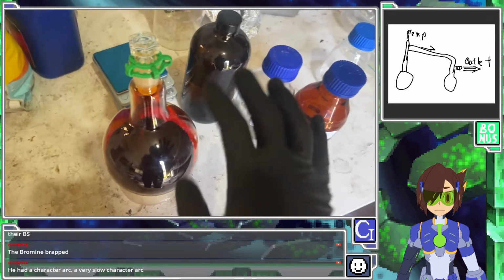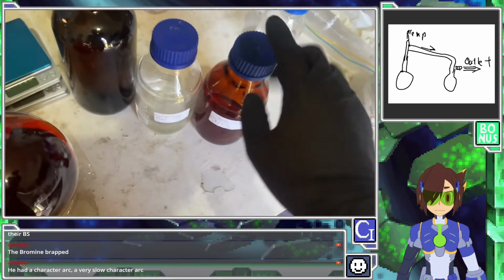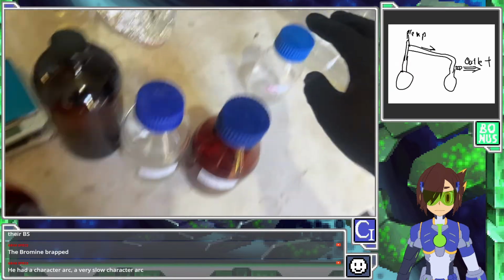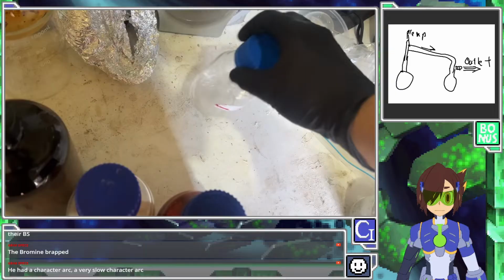That's fantastic. So we've actually completed the whole set. The family's back together. Scaled down because the gang is here. I went back and re-separated out some of the azeotropic dioxane.